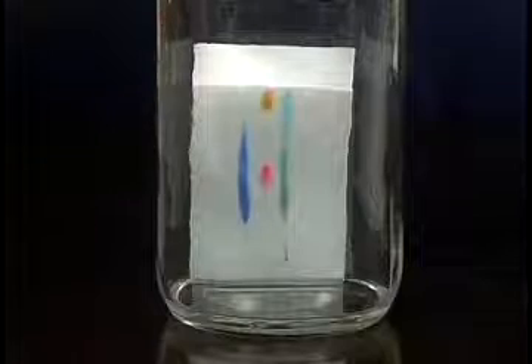If you have a streak — like in this example where we've chromatographed ink from various pens — instead of a discrete spot there's a streak, that means that you've overloaded the plate. The thing to do then is to dilute the sample and spot it on a fresh plate and run it again.